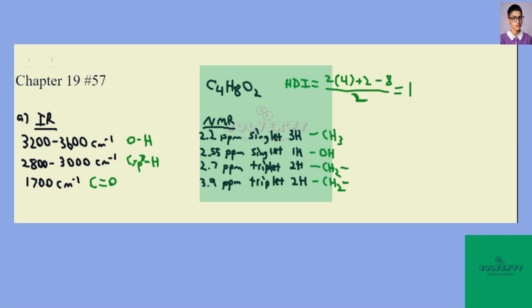So one end of the molecule right now looks like this, I think. So CH2OH. And then that's going to be attached to a CH2 as well. Okay, and then I'm going to say that CH2 is attached to our carbonyl. Okay, and then our carbonyl is going to be attached to the methyl group that we have. And I think that makes sense, right?